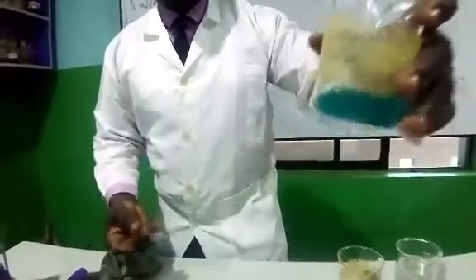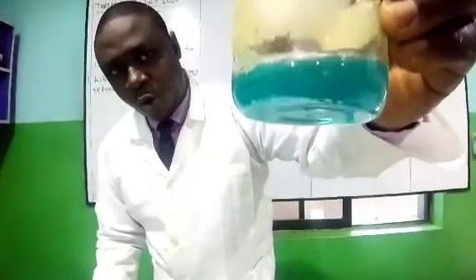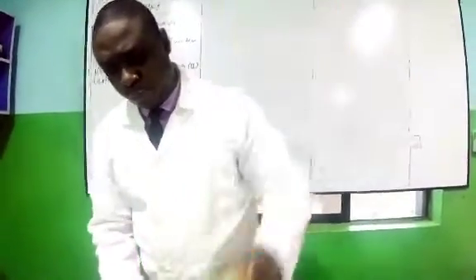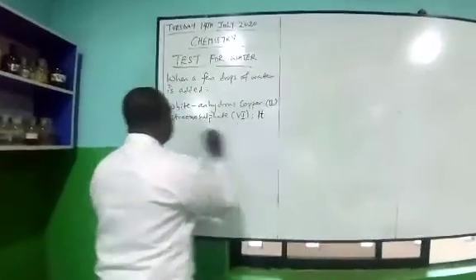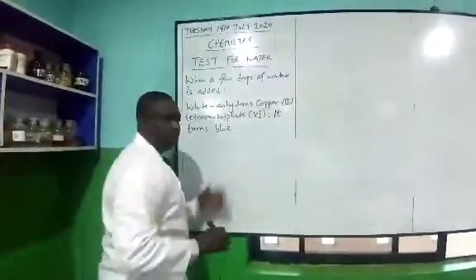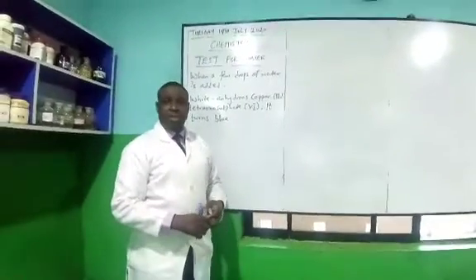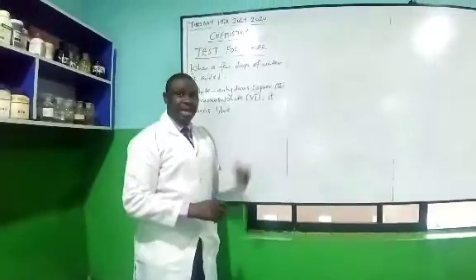Now, having done that, what color can you say this is? Of course, it's blue. So it turns blue. Now, that is a confirmation of what they have carried out in the experiment, and it's a standard result.